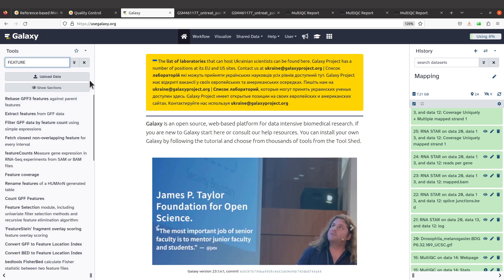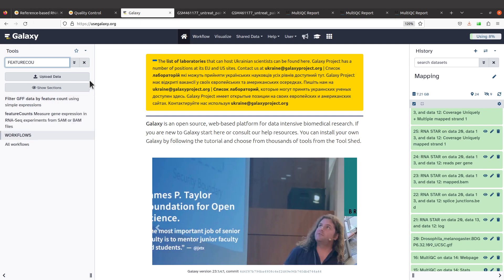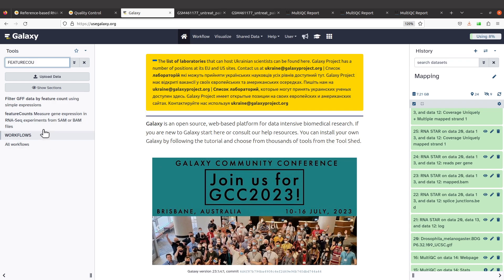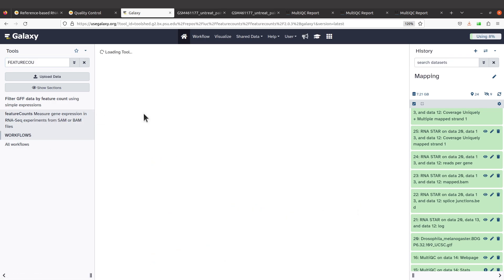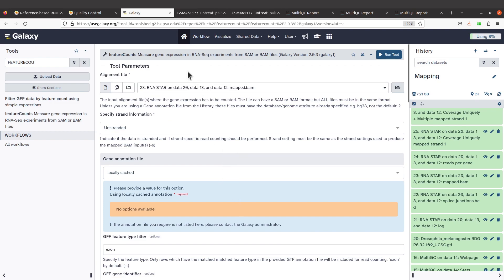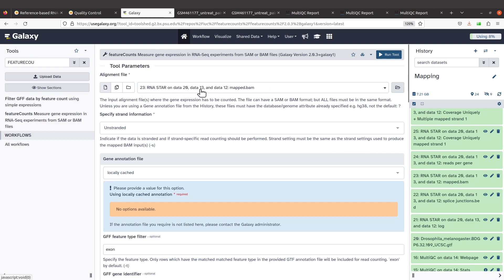I'll type feature counts in the search. We have it here — it says feature counts — so we click it. After clicking, you will have this interface appear. It says alignment file. For me, the alignment file is data number 23, which I showed earlier. That is my alignment file and it's selected. If you're using your own data, make sure to select the file that corresponds to your data.